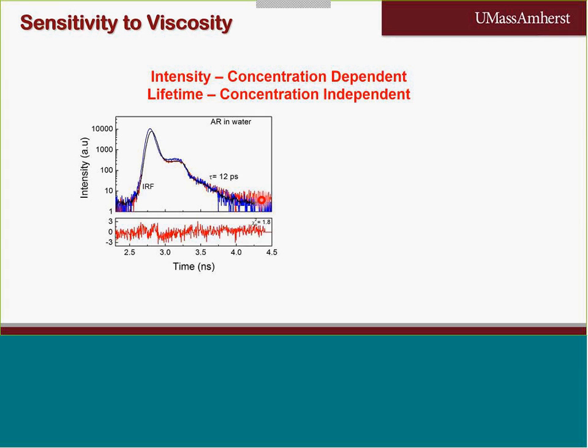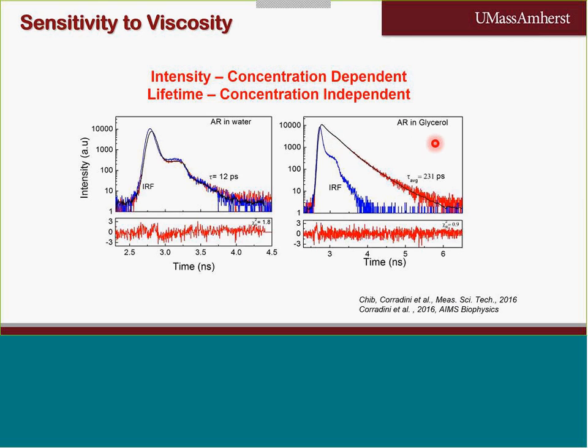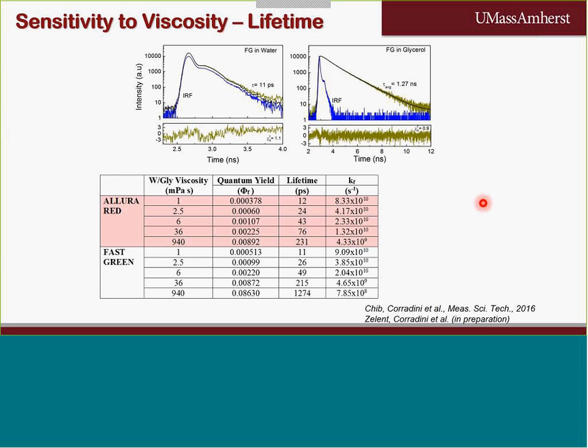But when we change the Allura red and put it in glycerol, we see an increase in lifetime of this particular molecular rotor. We tested not only Allura red, but the whole set of synthetic and natural dyes, and in all cases we obtained that by changing the viscosity, we saw changes in the measurements of the lifetime.